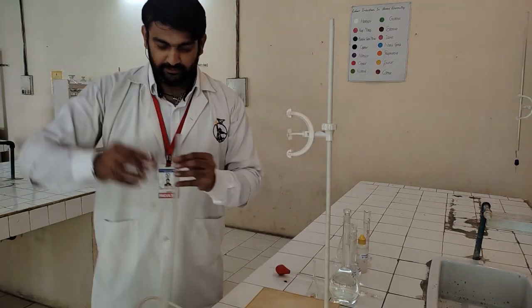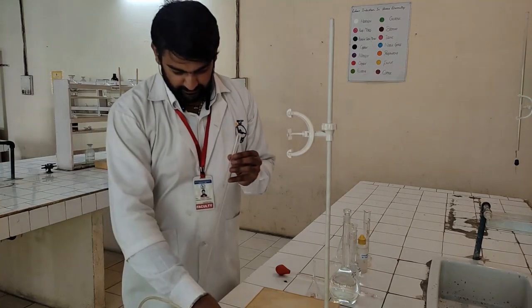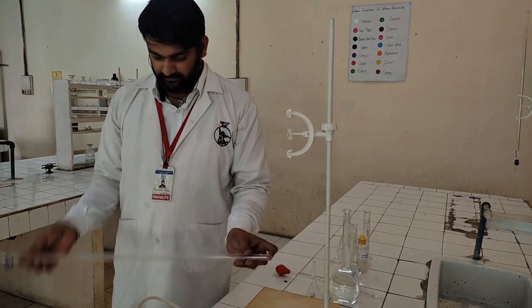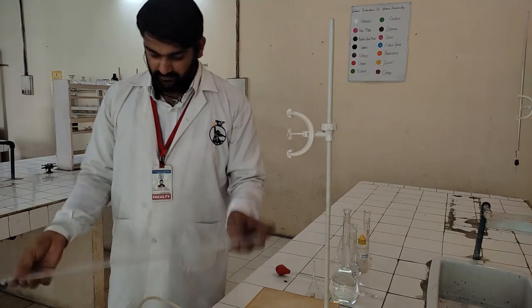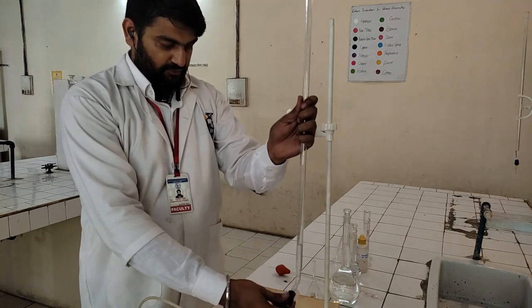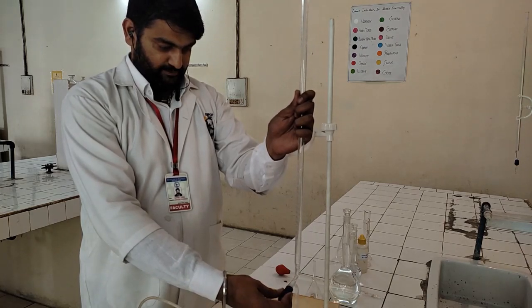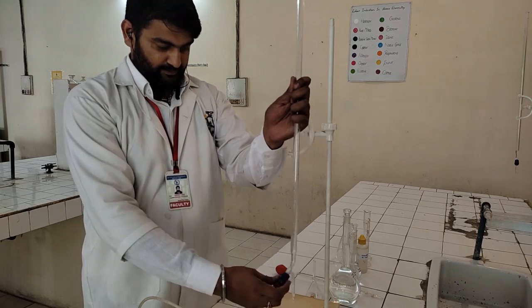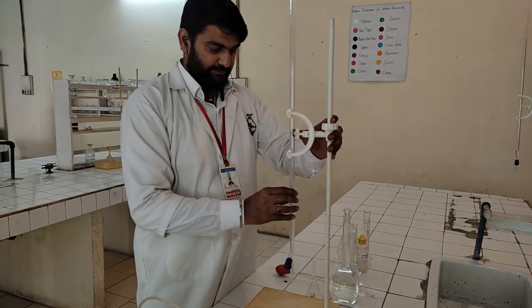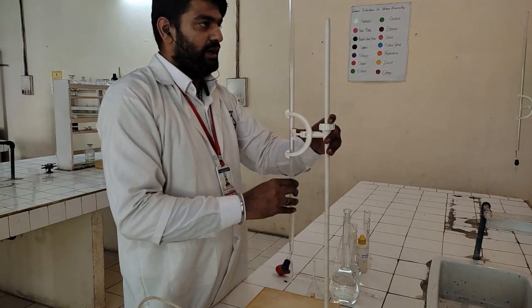Rinse once more, and allow it to flow. Now mount the burette onto the stand and adjust it according to your own eye level.